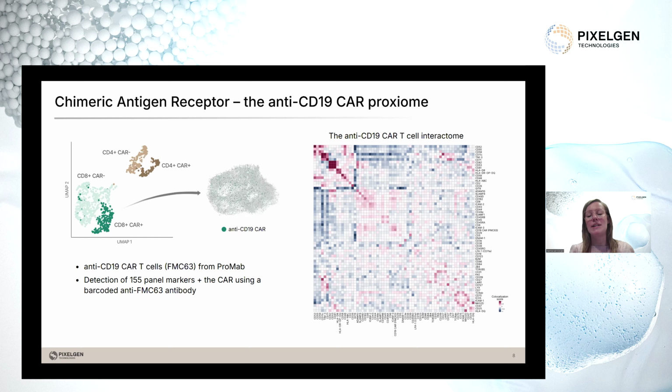So for example, HLA, beta-2M, we have positive scores. We have different integrins that contain 2 different subunits. For example, LFA1, it contains both CD11A and CD18, and they are also showing positive scores. You can also start to see more complex structures. For example, here you see multiple proteins that are all colocalizing with each other. And these are then examples of these multi-protein domains.